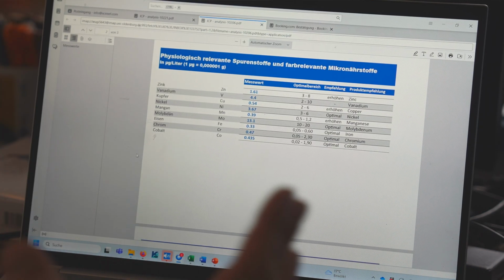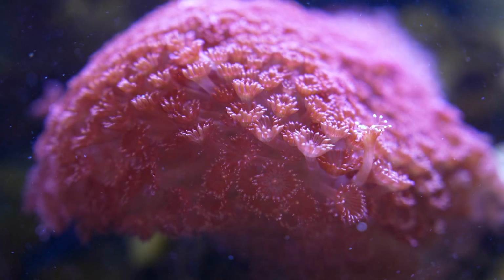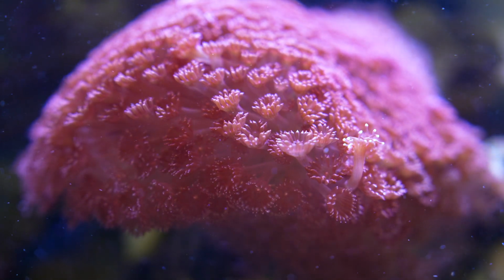lot of metabolic processes, also coloration, and can also be problematic because most of these metals can be fairly toxic if there's too much in the water, like copper, nickel, zinc. So if there's too high concentrations, the corals really don't like it.